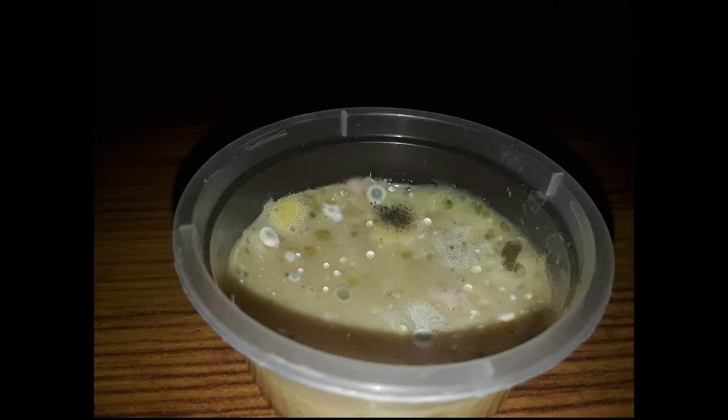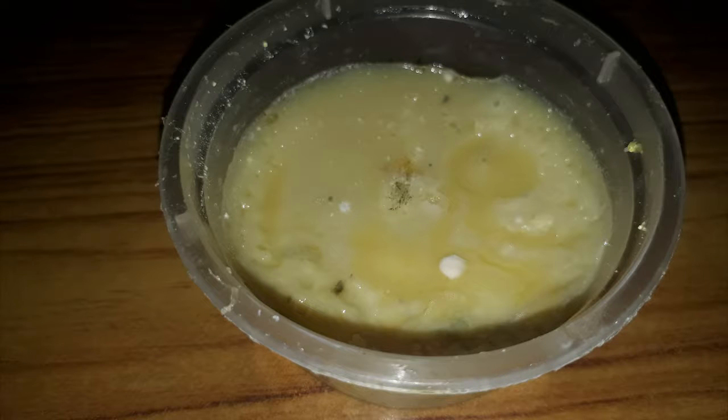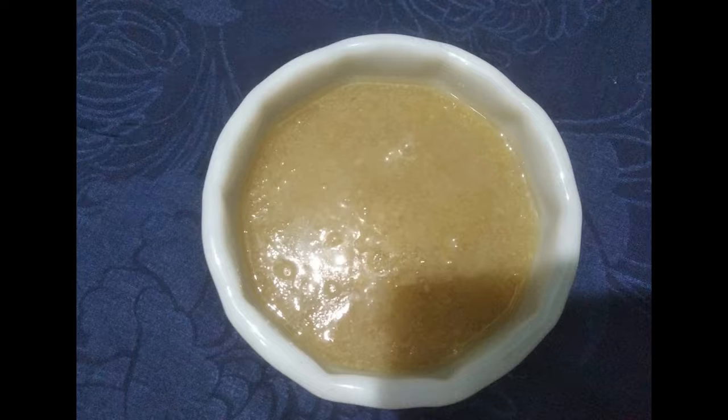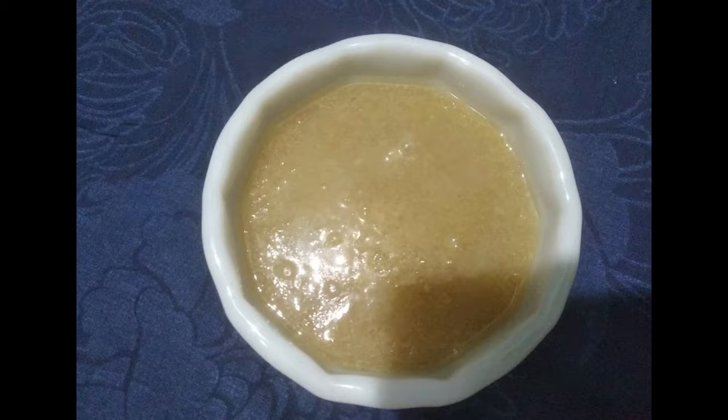Now let's see the results. First, Anjali's experiment result. As we can see in this sample with no antibiotic, there is bacterial colony growth present. Whereas in the sample where antibiotic is present, there is very, very little bacterial growth. After two days, we can see that in both cases, the samples with no antibiotic show bacterial colonies and bacterial growth.